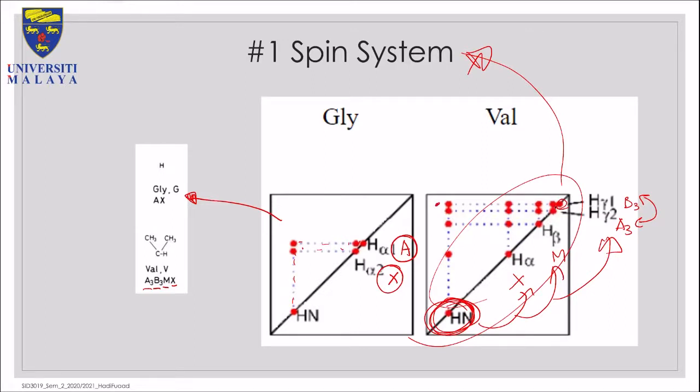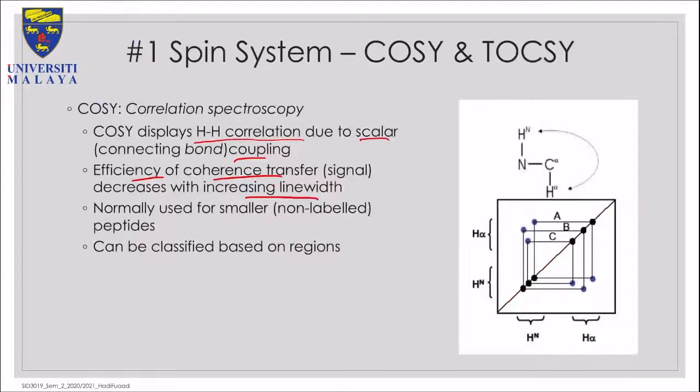As the peak gets nearer to the proton of interest, then you can see the peak is bigger. But this figure over here is just to show you in a theoretical manner. This is by no means the experimental. I'll show you a little bit on the experimental soon.